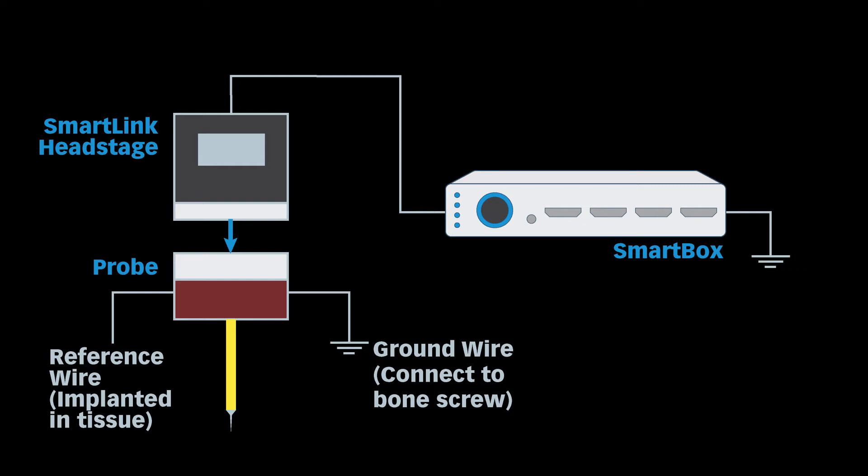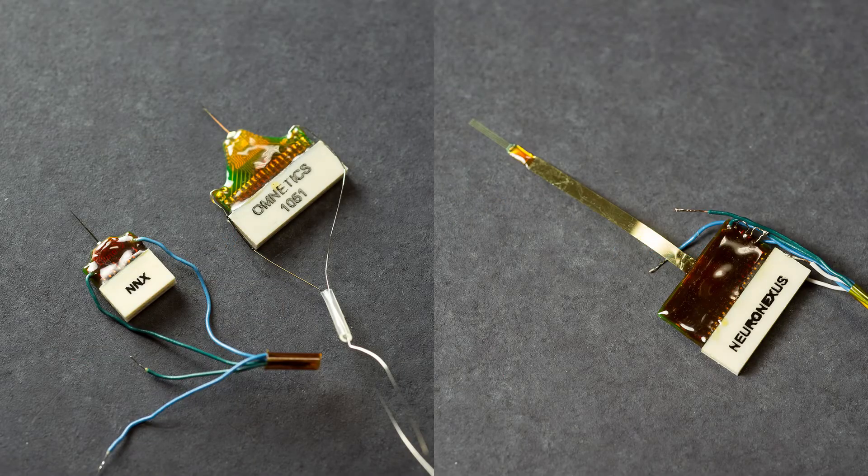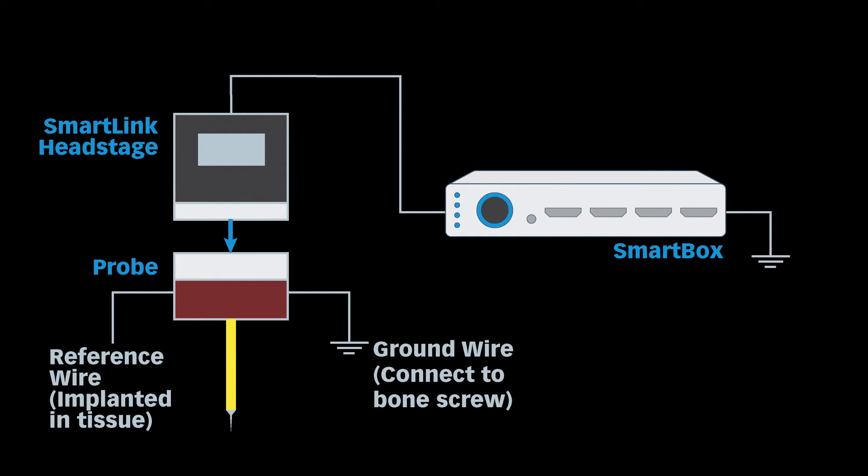For chronic experiments, you should use chronic smart link head stages, which have connectors that match Neuronexus chronic probes. Other conventional probes can be used as well. Each chronic smart link head stage has two jumpers and uses ground and reference connections from the implanted probe. Connect the ground wire on the probe to the animal, for example via a bone screw. The jumpers allow for different reference configurations, with options to select either the probe reference site or the head stage reference connection, and to measure voltage with respect to your selected reference source or relative to ground.